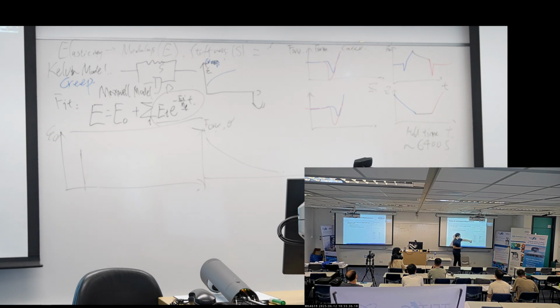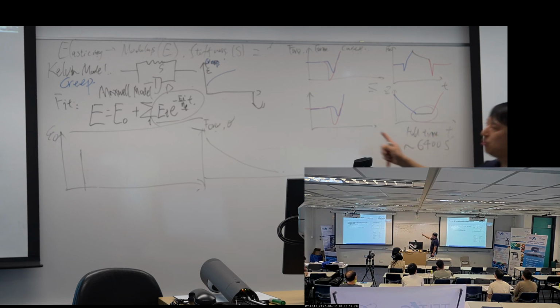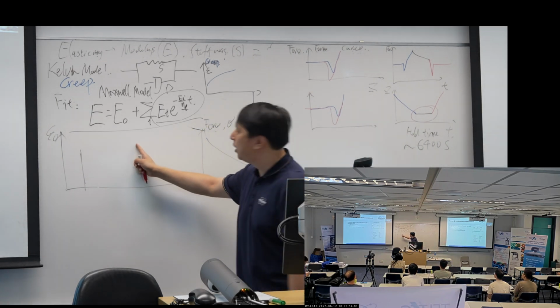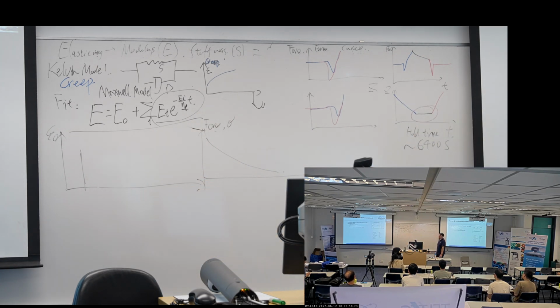And the next parameter is the so-called hold samples. The hold samples is how many data points you want to capture during the hold. As we know, our next job is we capture the force, we capture the deformation, and we calculate stiffness and modulus out.